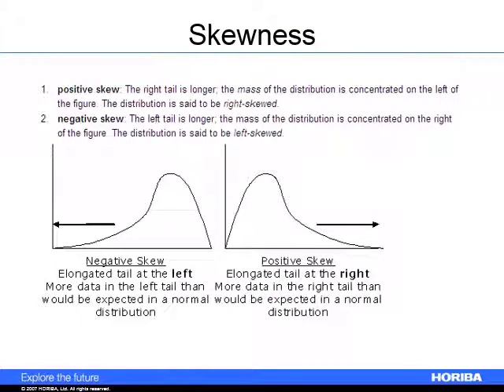Physically, when you look at your distribution, it can be skewed. You can have positive skew, negative skew. This is pretty simple. You would want to consider this when you're looking at particle size data. This will tell you sometimes that something was bigger and it's been milled, because you start to get tails, and then the effectiveness of milling something down might not be as much. So typically when you have something that started out a certain way, you'd have that skew of finer particles as you start breaking it down, but then they don't break down unless you change your milling behavior. So this can tell you things about the material. It can tell you if something's been filtered to a filter size. Just something to look at and consider in your data.